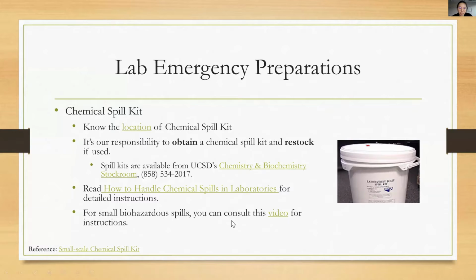The chemical spill kits. So also knowing the location of that and how to handle the chemical spills. I have the link here and also a short video of how to deal with biohazard spills. And it's the same as the first aid kit. If you use any of them, please let me know so that I can buy them back from the UCSD chemical stockroom.